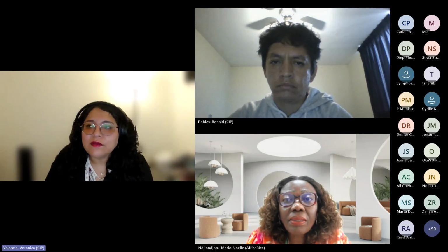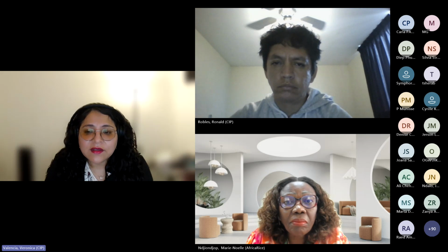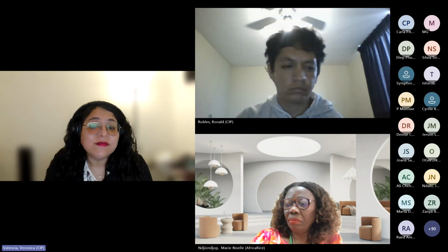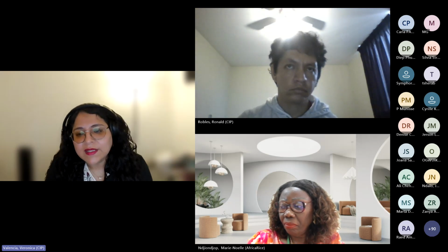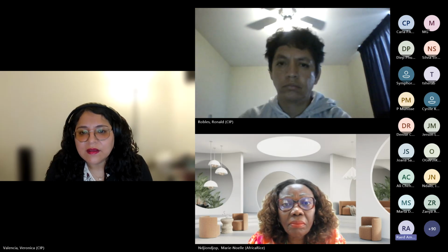Yes, well, we don't normally work with degraded materials, but I know there are specific protocols for this. I think there are some commercial kits for old materials, right? But at the end, you will have to deal with low quality, I think. So what do you think, Ronald? Yeah, great.